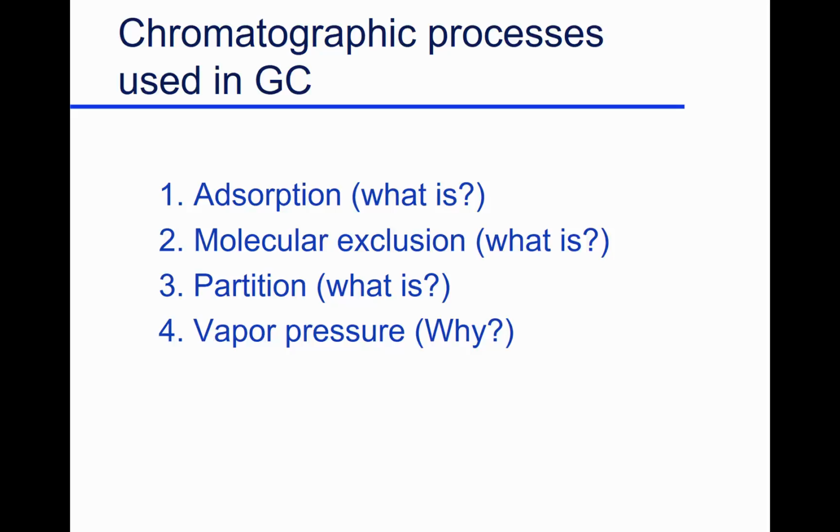More so. Molecular exclusion, what's that? Size exclusion, sure. How does that work? What's your basis of separation? It's a separation based primarily on size. Size of the molecule, sure. So you separate on the basis of size. Here, this one's more for affinity to a surface of some kind or some part of the surface. Molecular exclusion separates on the basis of size. Have you done any partition chromatography?